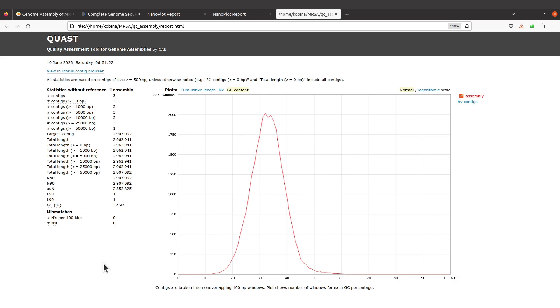We also have some measurements that can be done or that are done if you supply QUAST with a reference sequence, for example mapping. Because we do not supply any reference sequence, we don't have the statistics with reference being displayed for us. It was not done. We also have our file here, our sample here.